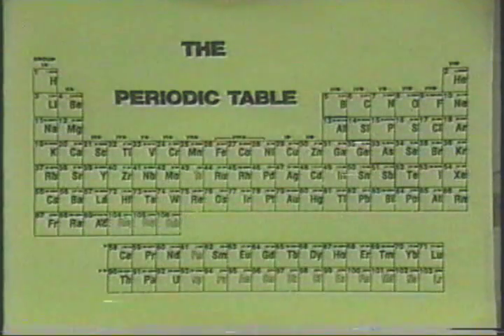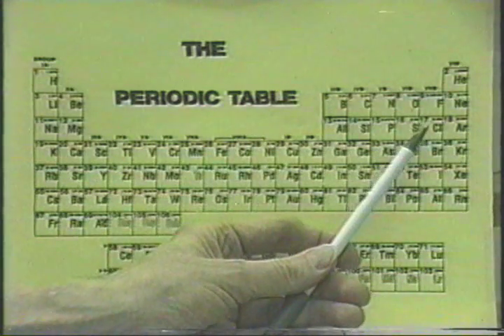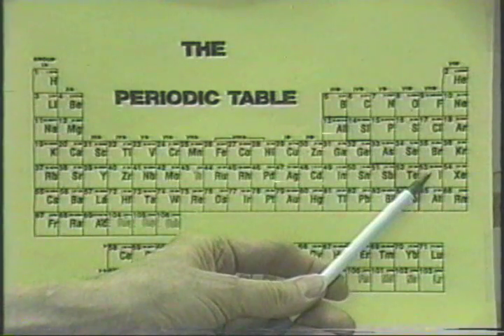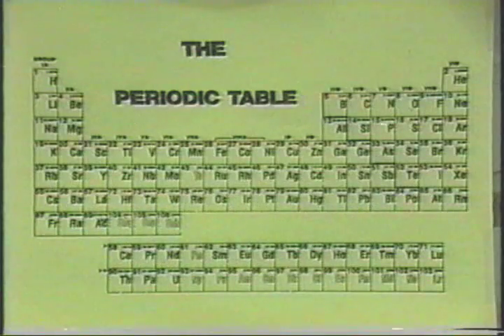Applying these ideas specifically to today's experiment, we'll study the solubility of group 2 cations with various large anions. Now, this will depend mainly on the size of the group 2 cation. We will also study the oxidation of the group 7 halide ions. Now, while this is a more complicated case, it will depend in a large part on the ease of removal of electrons from the halide anions.